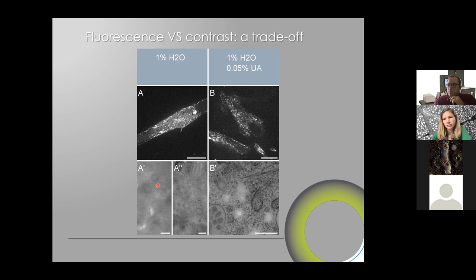And then this is with post-staining. The post-staining brings up a bit of contrast, but in no way is it comparable to what we got in the freeze substitution cocktail having 0.05% of uranyl acetate. I don't know how this works, I have no clue, but one thing is sure: having the UA directly in the cocktail during the freeze substitution has a much better impact than the post-staining.